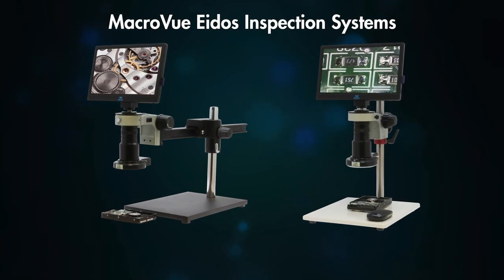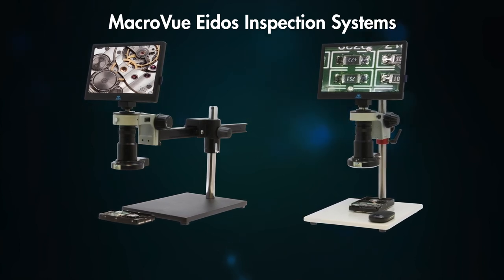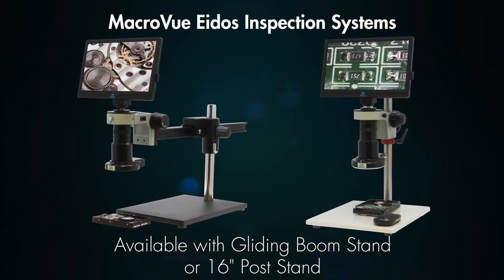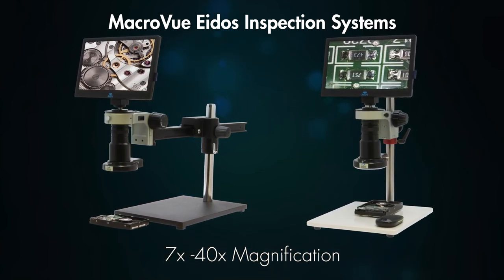The Eidos is also featured in our new MacroVue video inspection systems available with a gliding boom stand or a 16-inch post stand and offers a magnification range of 7x to 40x at a 6-inch working distance.